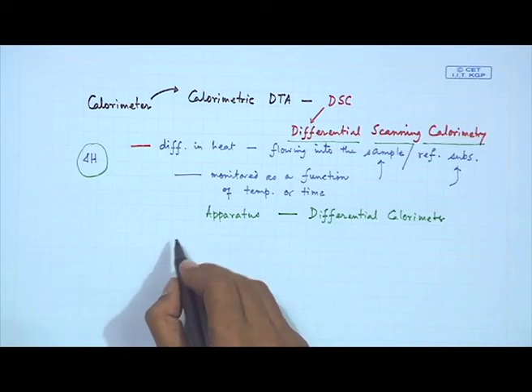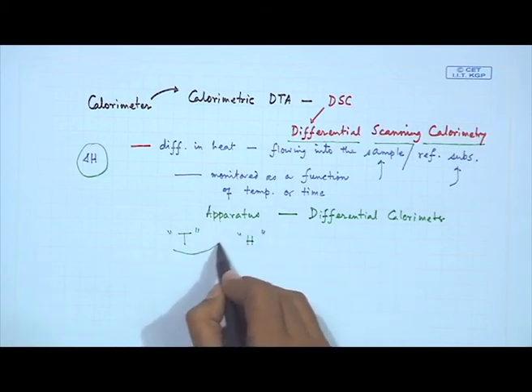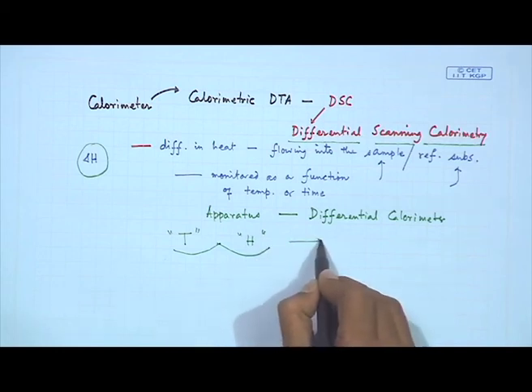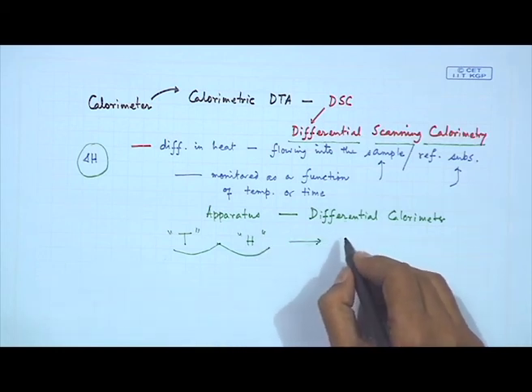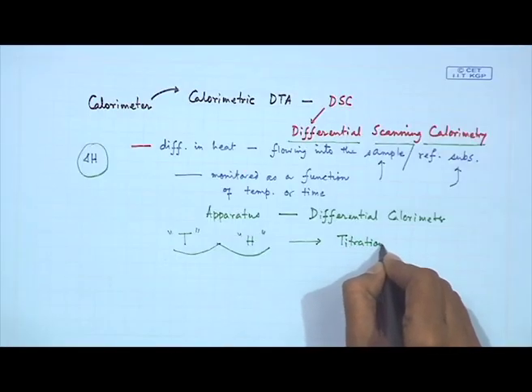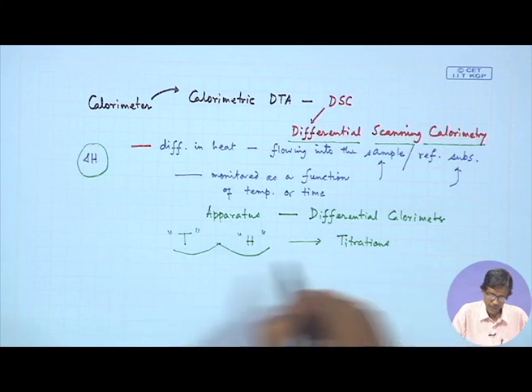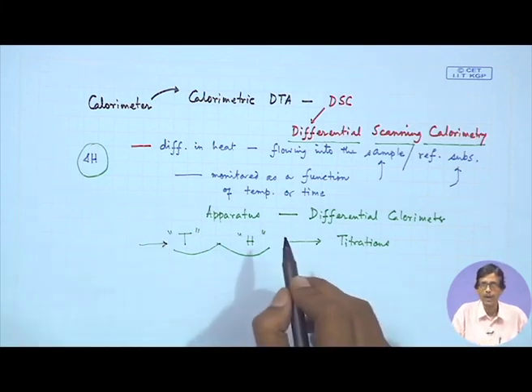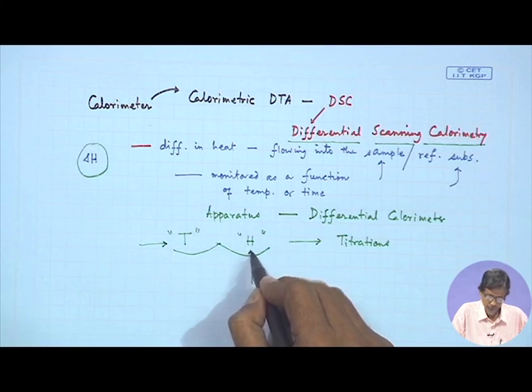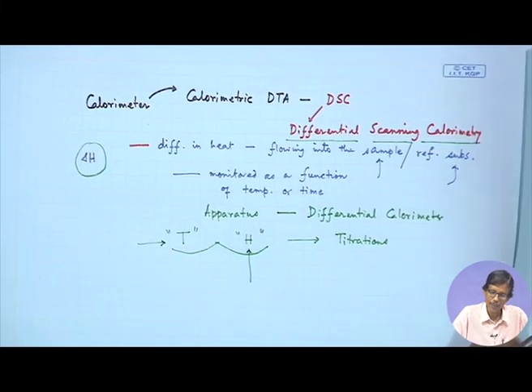So, in all these cases what we are discussing so far is the corresponding temperature effect or the heat effect. Then we can introduce these two things to something where we all know that the analysis is incomplete if we do not talk about the corresponding titrations, simple acid base titrations and all these things, but we do not know when we go for some acid base titration what is the corresponding temperature change for the reaction vessel and what is the heat effect for the corresponding neutralization reaction. So, that we will see in our next class, how we can differentiate these two from our standard titrations. Thank you very much.